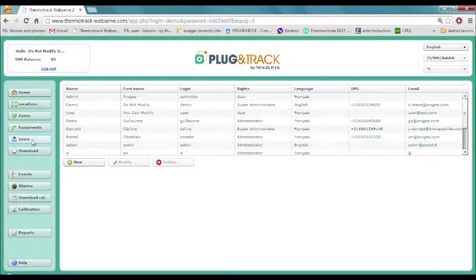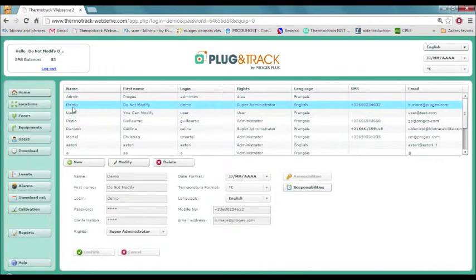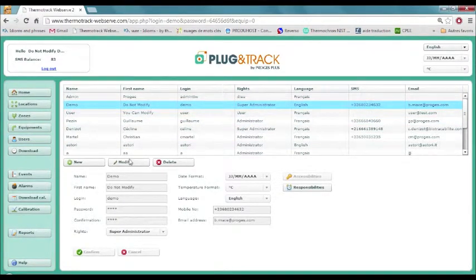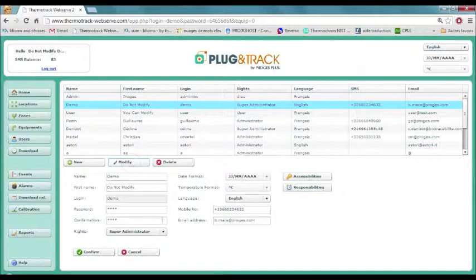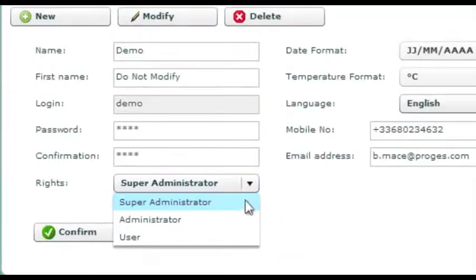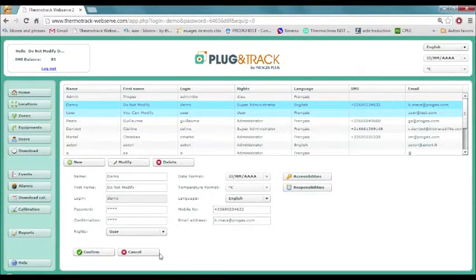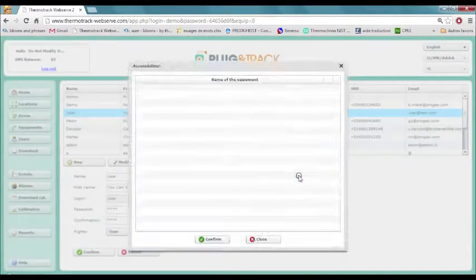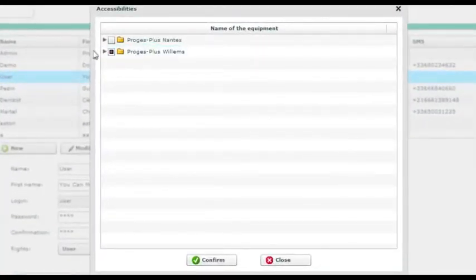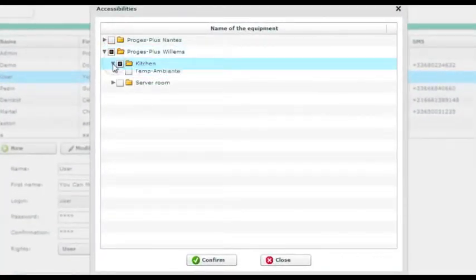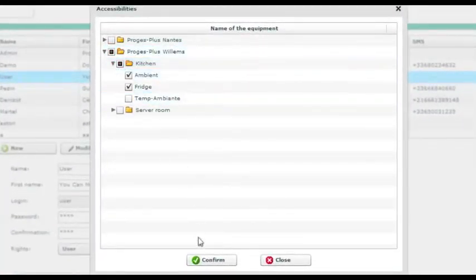You can create as many users as you like. Each user will have different permissions depending from his status. Some users can only view some probes and not the others.